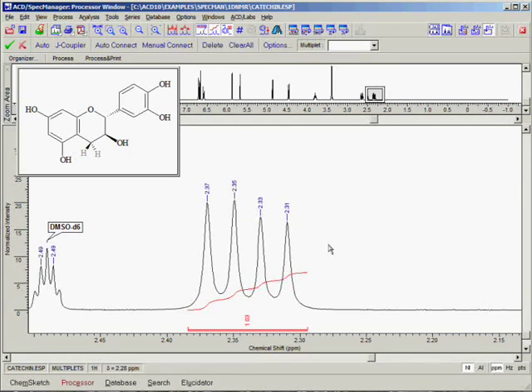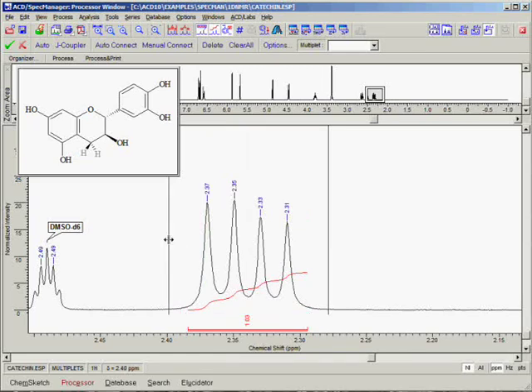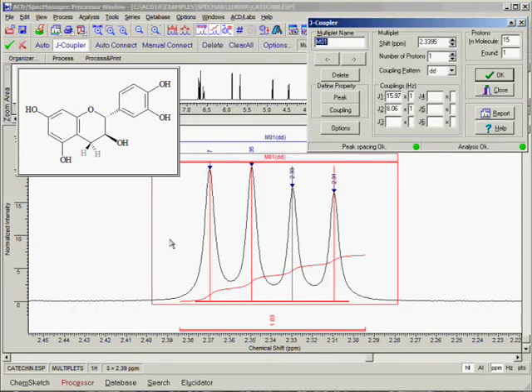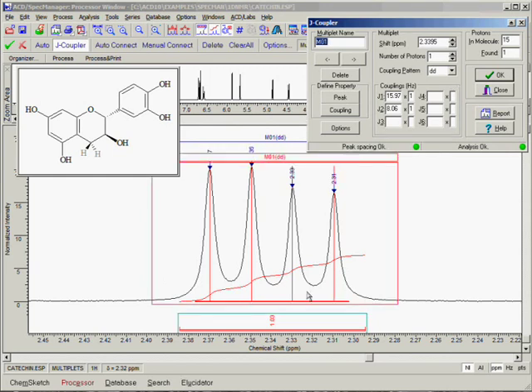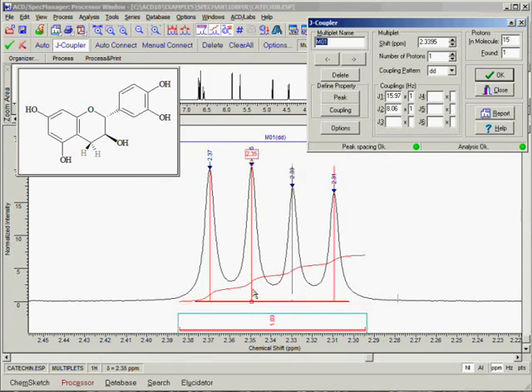Starting with the multiplet centered on 2.35 ppm, simply click and hold the left mouse button and drag across all of the peaks that belong to the first multiplet. When you release the mouse button, the multiplet is automatically created along with a red stick model of the coupling pattern that has been detected, and the J-Coupler dialog box appears.